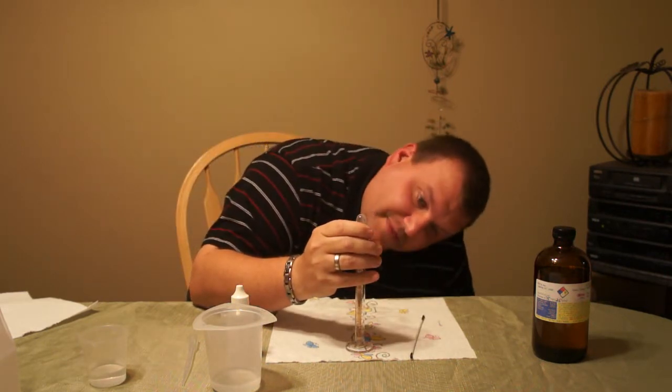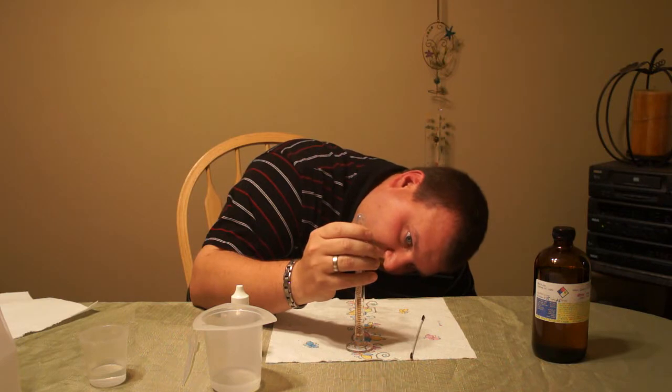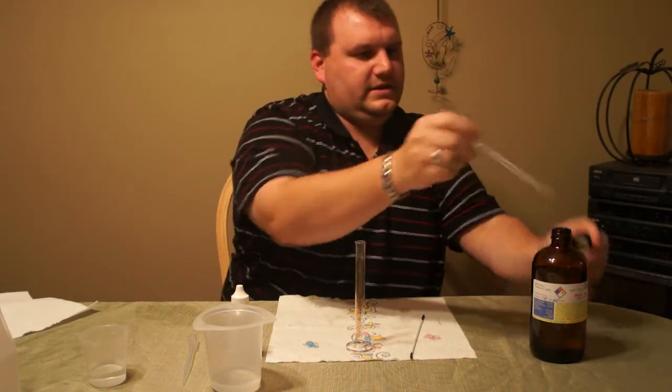I like using the pipette because you can get it all the way down in the graduated cylinder. You want to measure to the meniscus — that's the curved portion at the top. So I've got my nic in there.